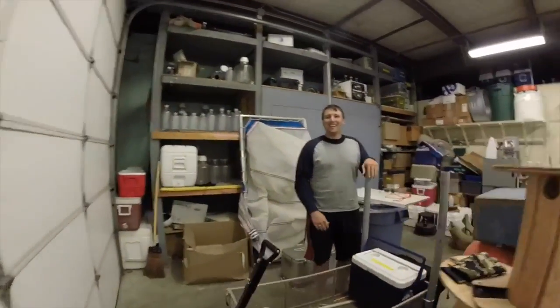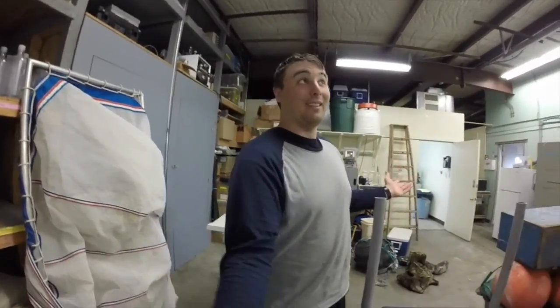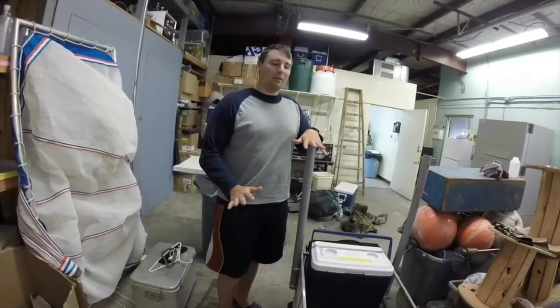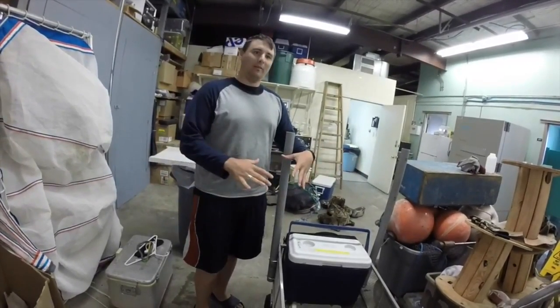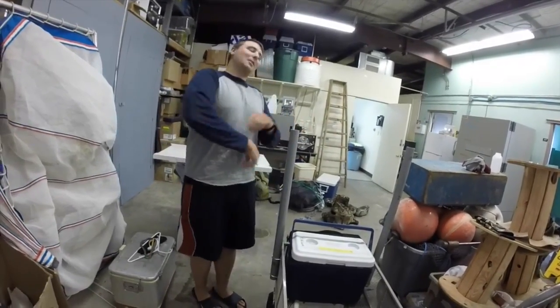Hi, welcome to Building 3. I'm Aaron, one of the field techs here at the Lake Michigan Field Station. You're standing in the high bay right now. This is where we do all the prep work for all of our field work — whether it's on a boat, beach seining, or any other field work. All the materials come in here first, we get together, and then we go out and do our thing. I'll show you around.